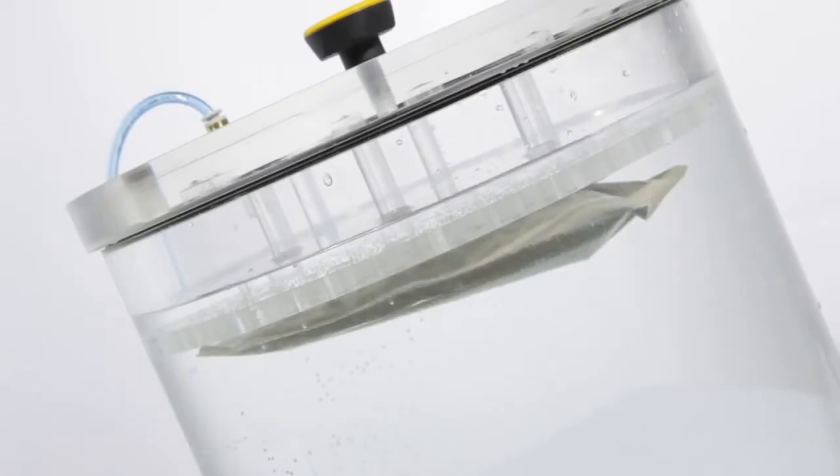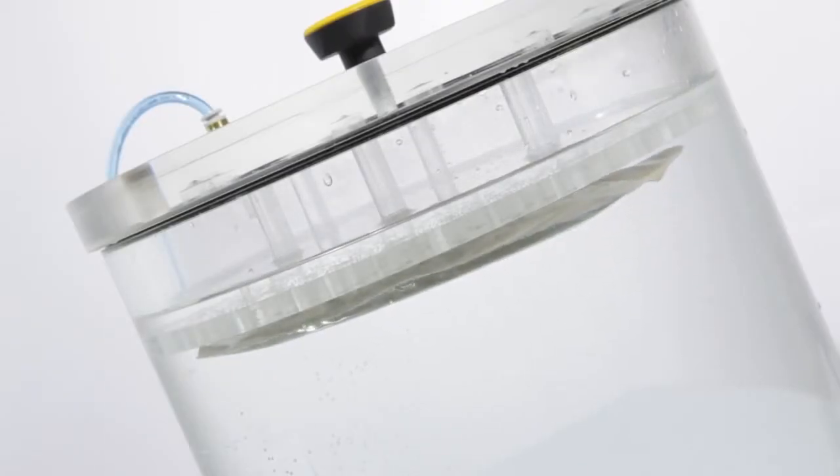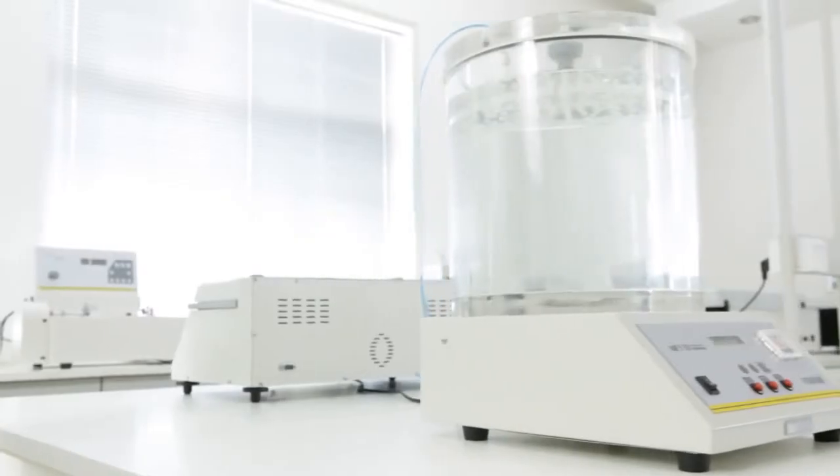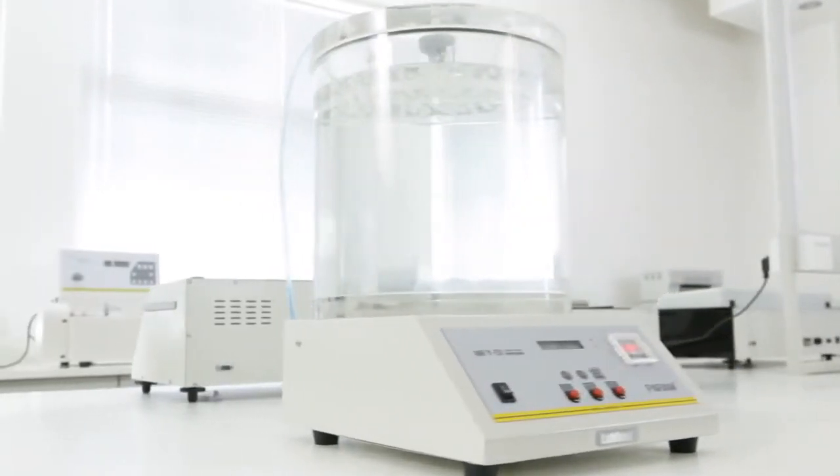By observing the leakage behavior of the specimen and how the specimen expands and restores to its original shape after vacuum release, users can quickly determine the sealing properties of the specimen.